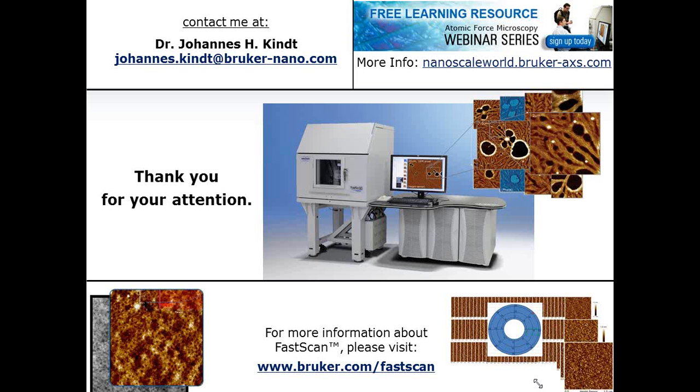So maybe that's a good segue into a couple of these questions, and I know we're running a little late. I'd like to hit maybe one or two more. So on sample prep, the question is, how do you image a tissue sample in the AFM? Essentially, how do you prepare it for scanning?